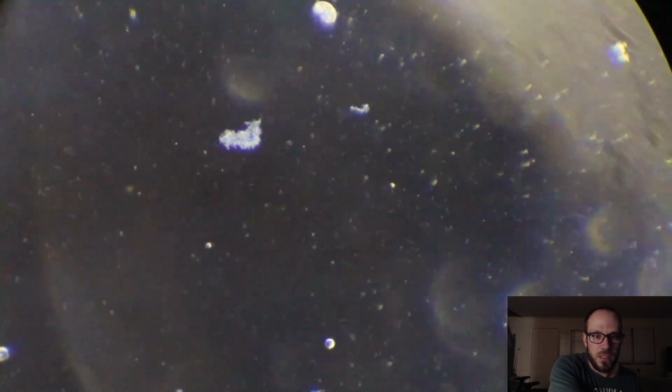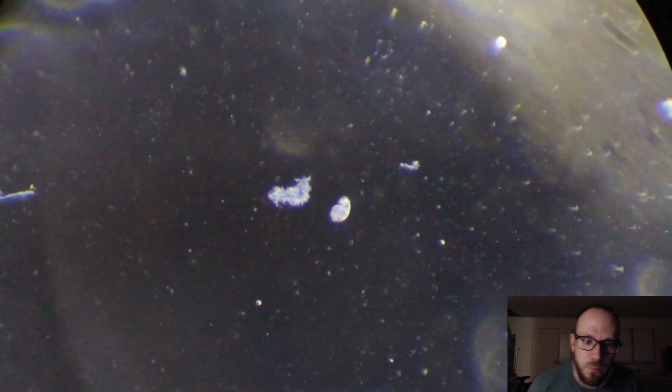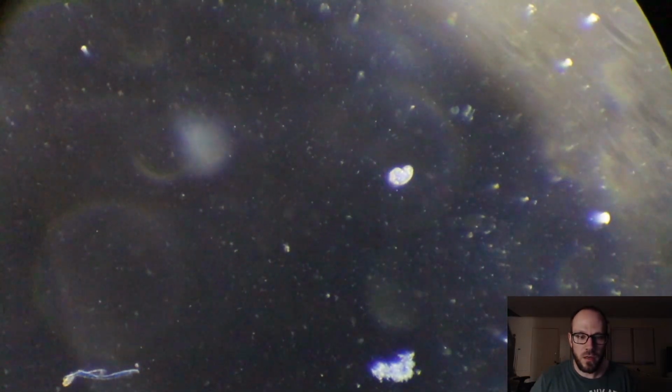I'm going to lower this a bit. That's a little too much. Let's try and get some contrast on that guy. You can see his cilia doing their thing. I wonder, actually, if he is a cilia, does that mean he's not a Paramecium? Yeah, I've seen a bunch of these guys in other slides. But yeah, he's just swimming around. Biggest guy we've seen yet, but we'll see bigger for sure. He ain't shit.